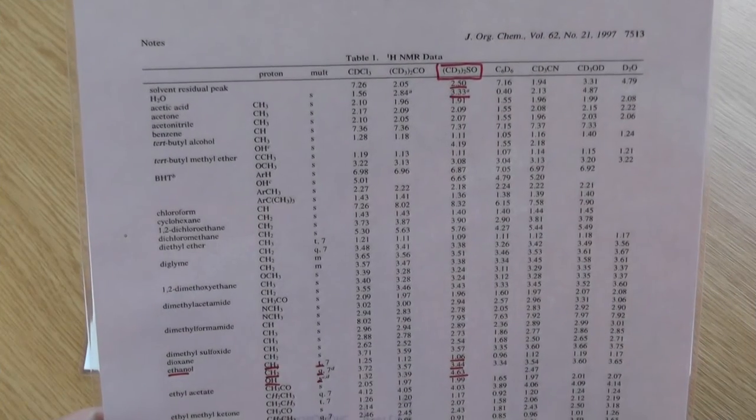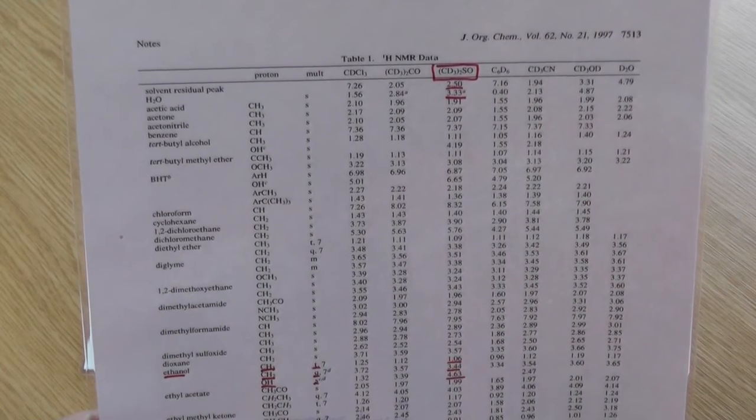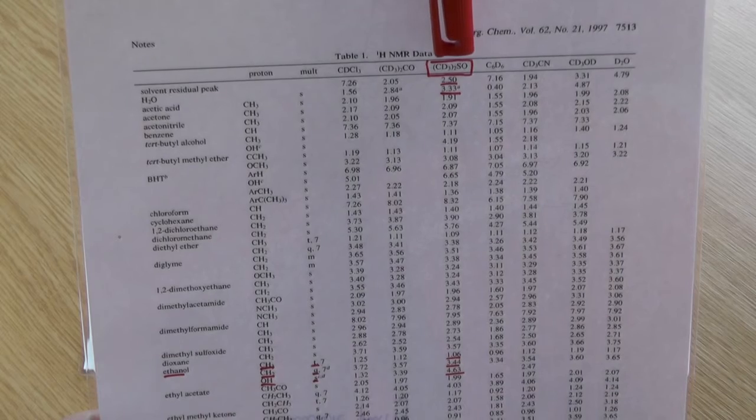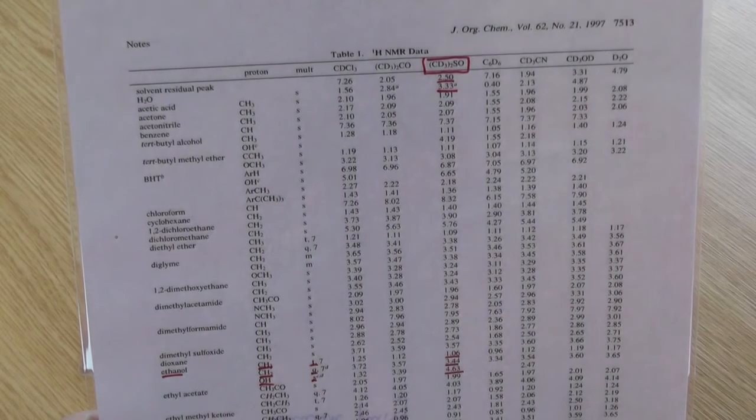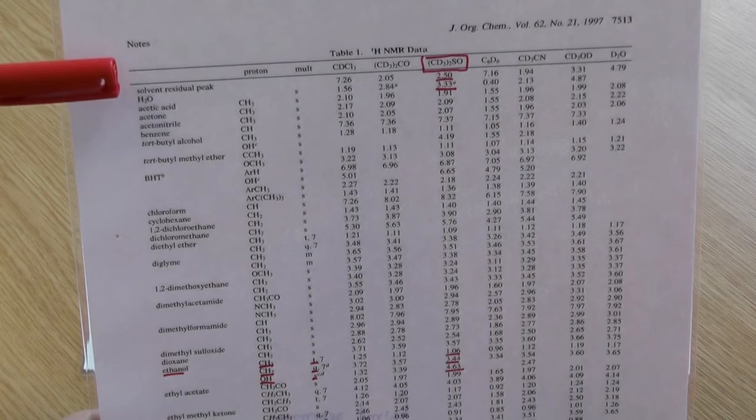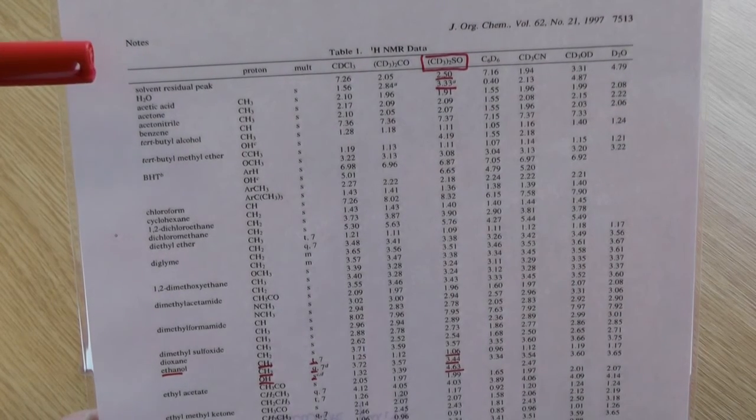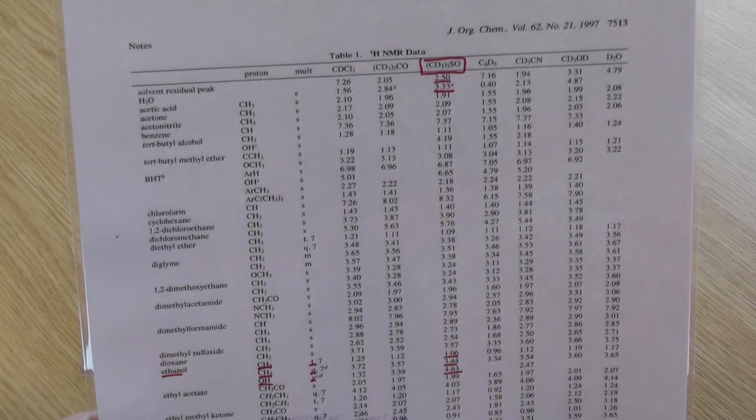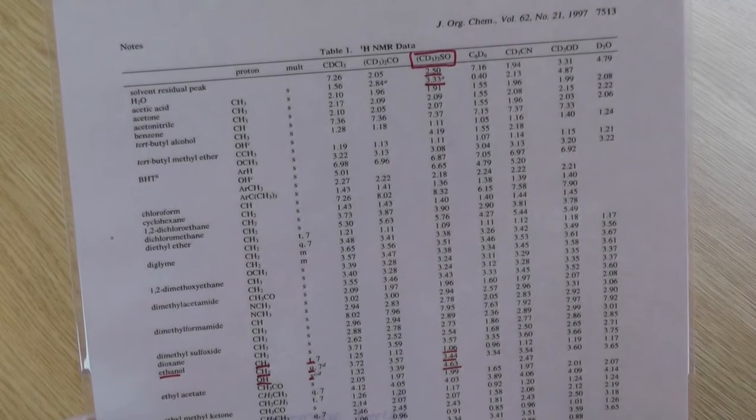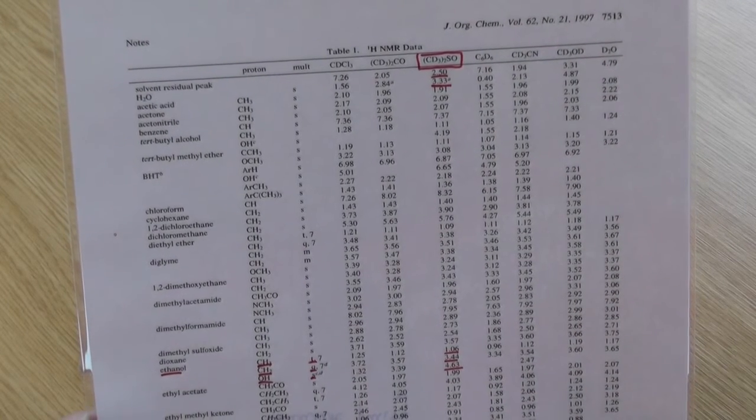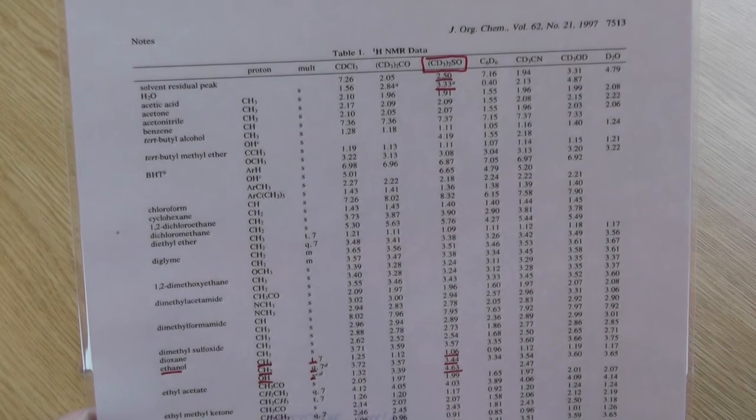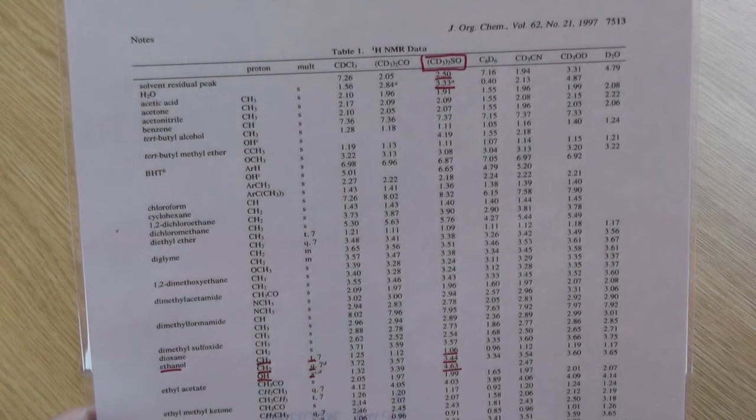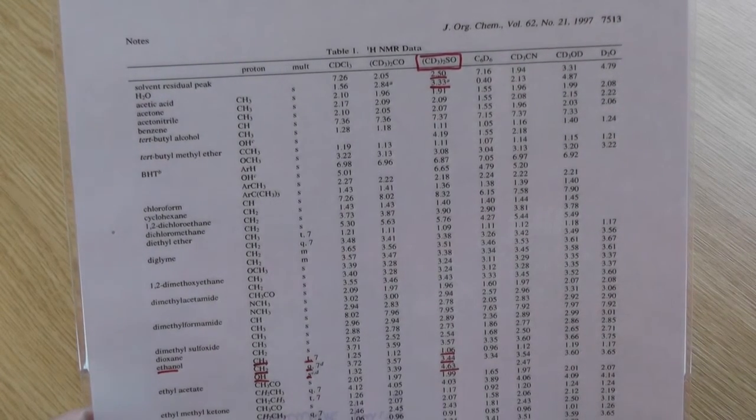Looking at the table, the top row has a list of deuterated solvents that you might have run your NMR spectrum in. We ran our spectrum in deuterated DMSO. You can see that there's a chemical shift for the solvent residual peak which is a peak caused by the deuterated solvent. Although the solvent is deuterated and you might not expect to see a peak from it, because of the way that deuterated solvents are made there will usually be a peak there from it. Also because of the way deuterated solvents are made there will usually be a water peak.